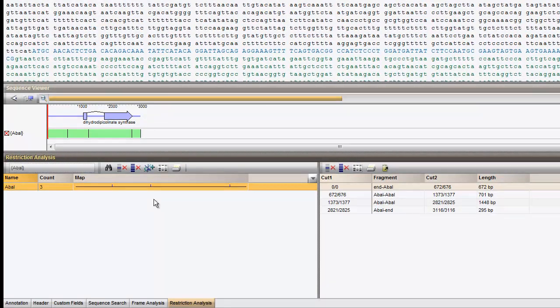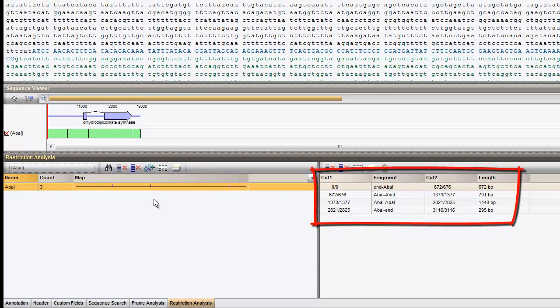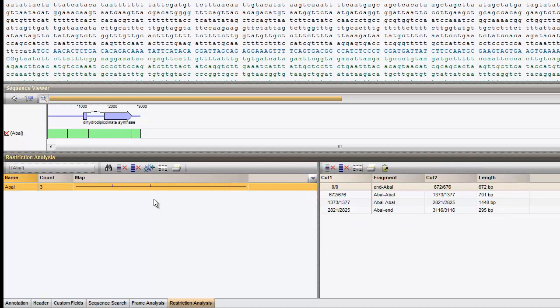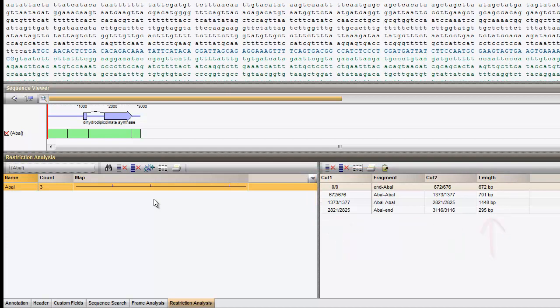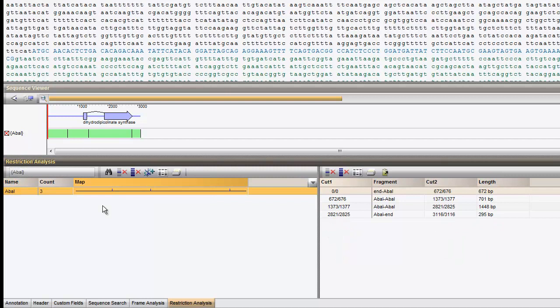The resulting fragments are listed in the right panel, with the cut positions and the length of the fragments. The fragments are graphically plotted in the middle panel.